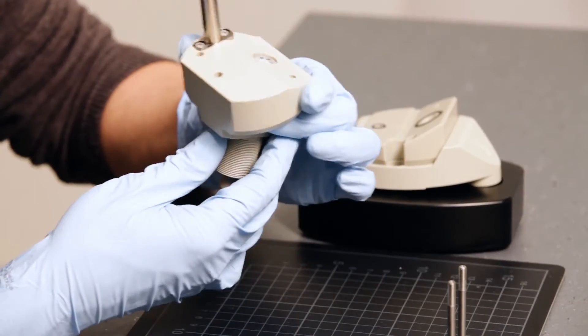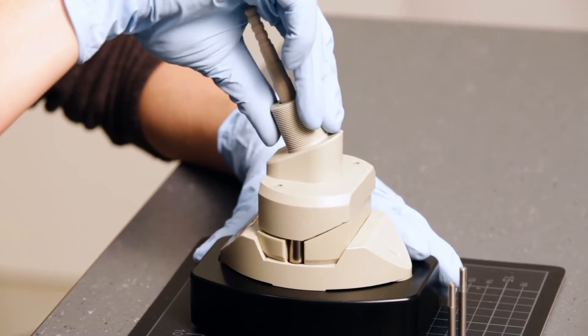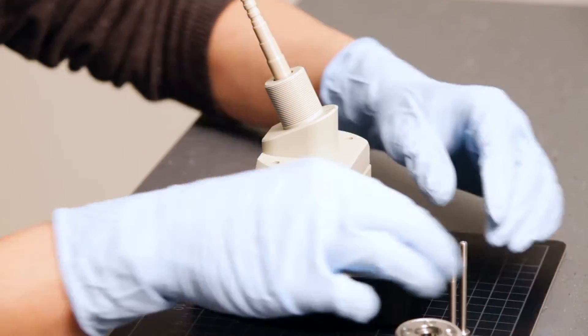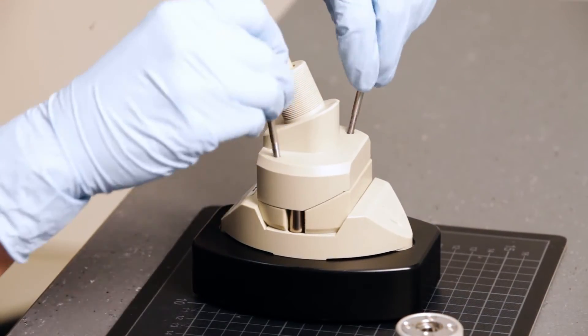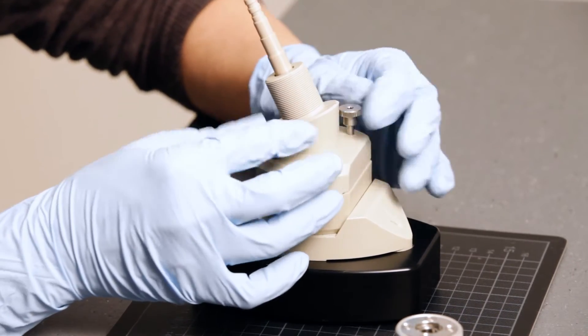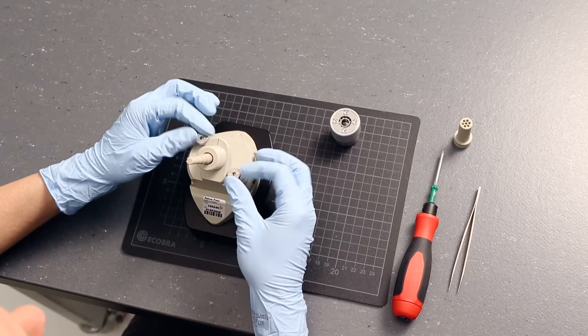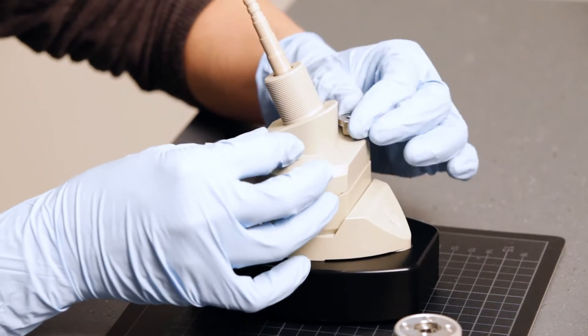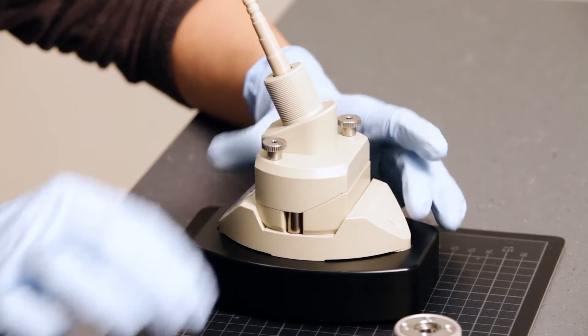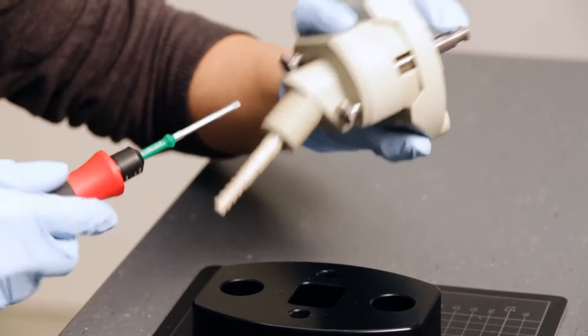Place the upper part of the cylindrical cell on the lower part of the cell and fix the two parts with the screws. Use the screwdriver to tighten them completely.